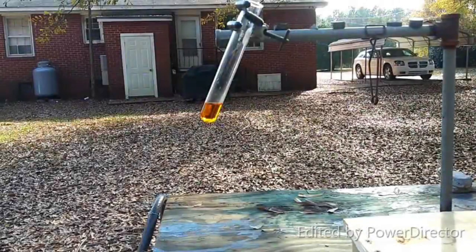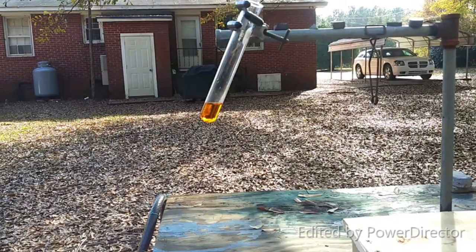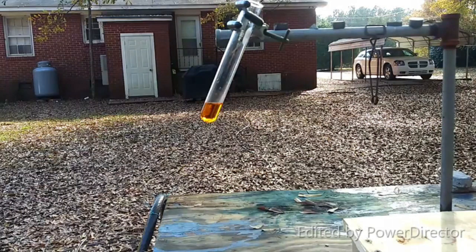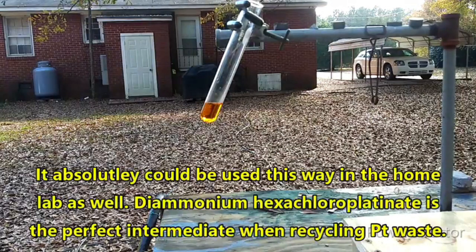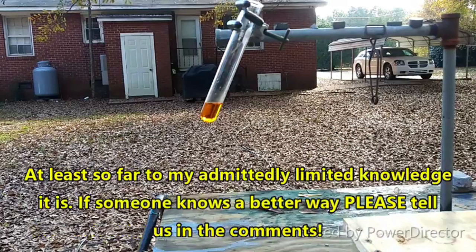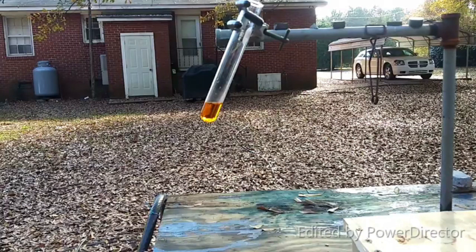Alright, everybody. Our next compound is going to be diammonium hexachloroplatinate. Diammonium hexachloroplatinate is very similar to dicesium hexachloroplatinate. However, I don't know if it's still used in industry or not, but it's very easily converted from the salt to platinum black or platinum sponge. If you just thermally decompose diammonium hexachloroplatinate, you will end up with platinum sponge.